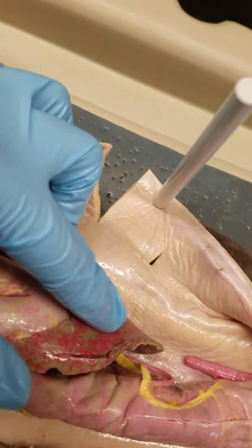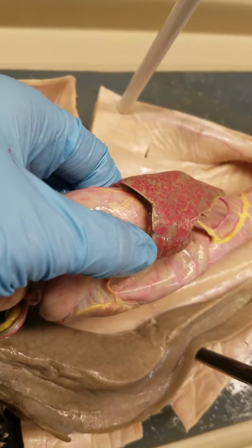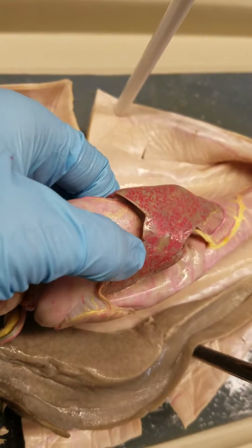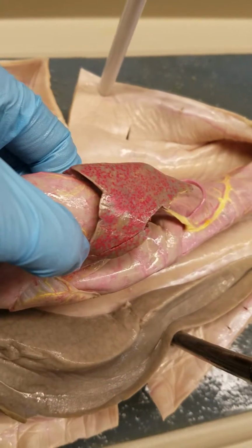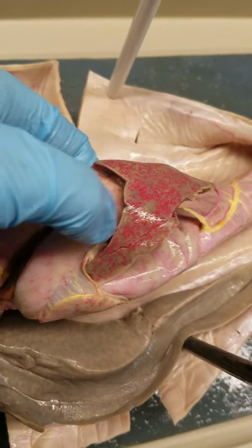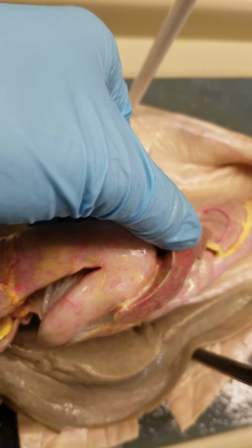You have your spleen here. So kind of hard to see, but between your stomach and your spleen here, you got your gastrosplenic ligament. It's very hard to see, but it should be in there.